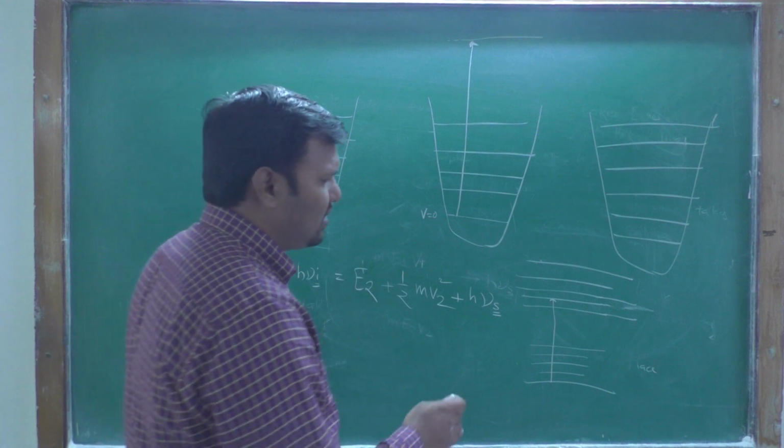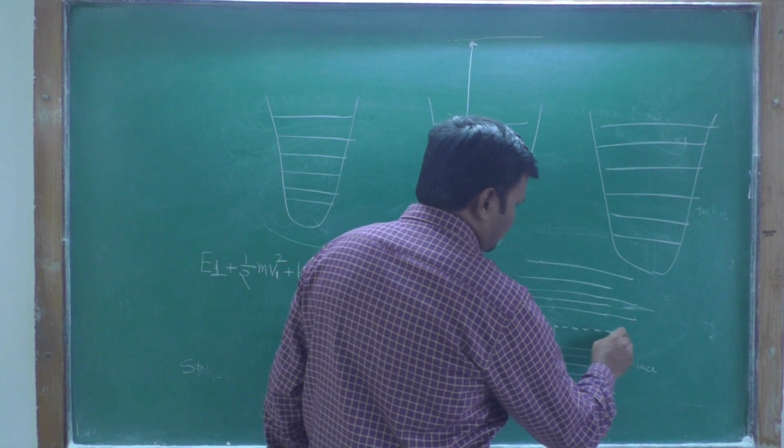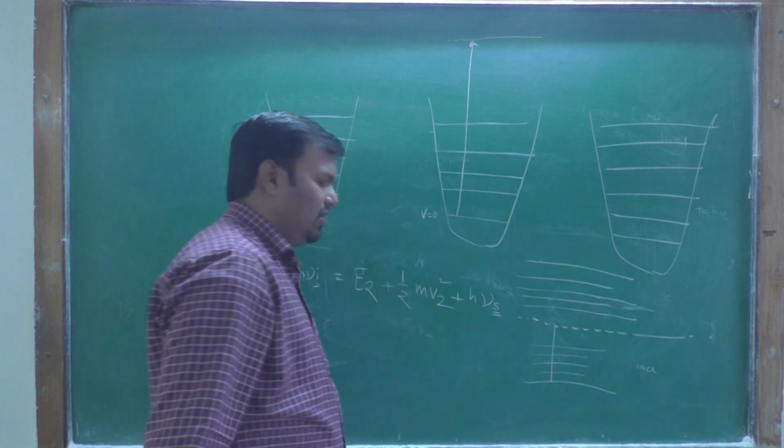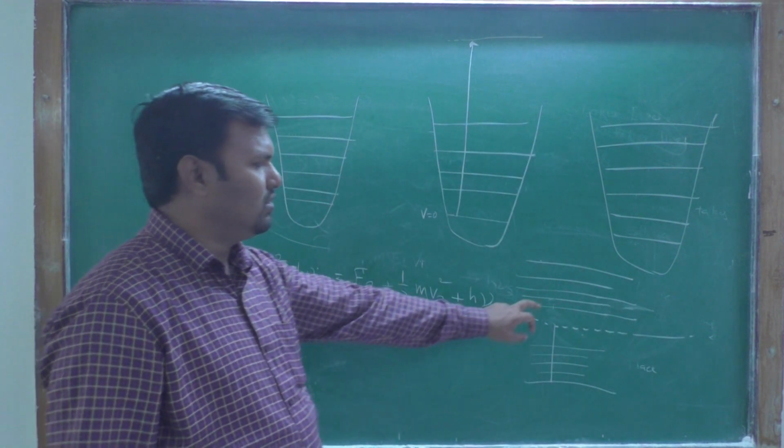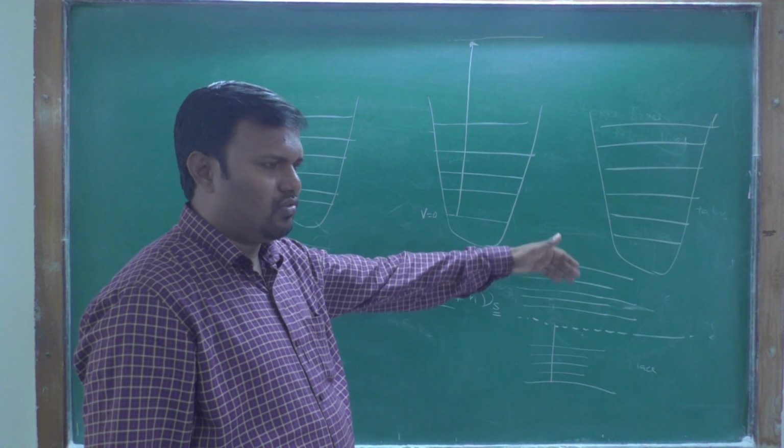But in this case it will not go to that. It will go to some intermediate energy state, not an electronic state, vibrational level, or rotational energy level.